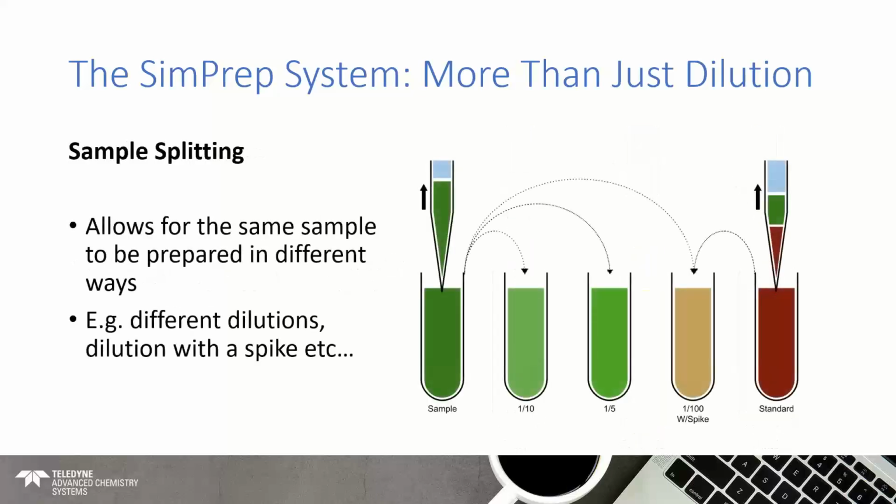And then splitting, I mentioned this before. So in a lot of cases today, samples will arrive at a site for analysis, but they won't just require trace element analysis. They might require analysis of a different technique that might be in a different laboratory. So what you might need to do when samples are received is split the sample into different volumes or prepare them in different ways so that those samples can then go off to different techniques for your analysis.